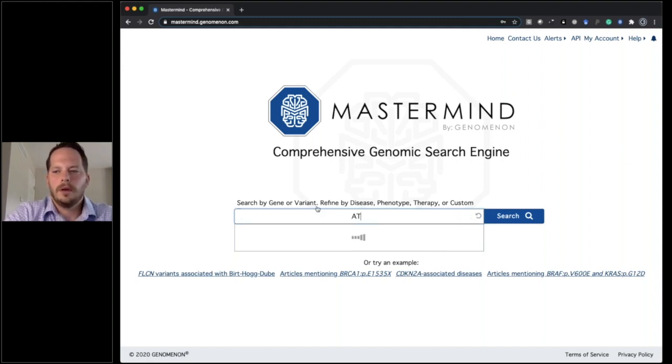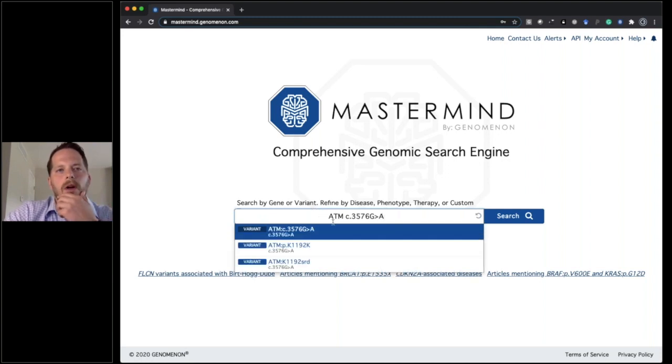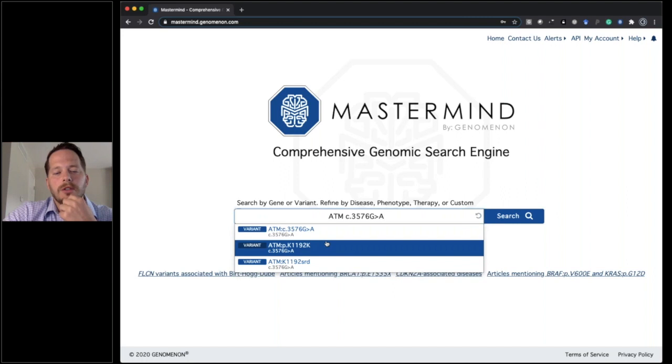Great. Thanks, Steve. So the sixth search example, again, builds on some of the concepts that Steve talked about, where you can see in this search example, in addition to the cDNA specific query, for this synonymous variant, I also have the option of selecting on that protein level query, which again is bucketing those results and doesn't prioritize because you didn't declare a specific interest in the C dot change.